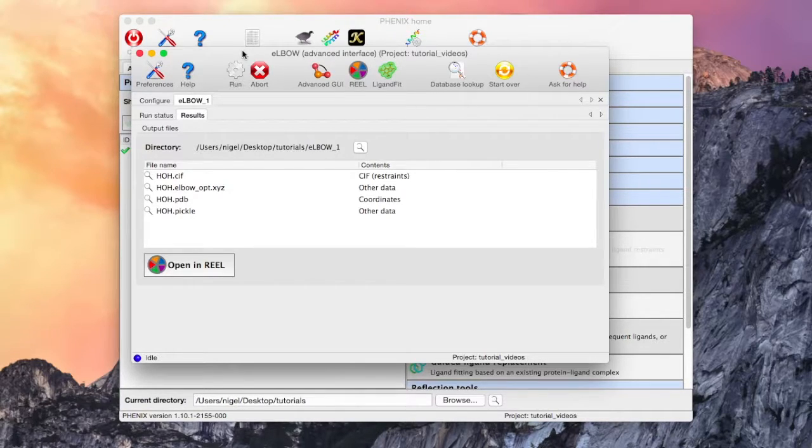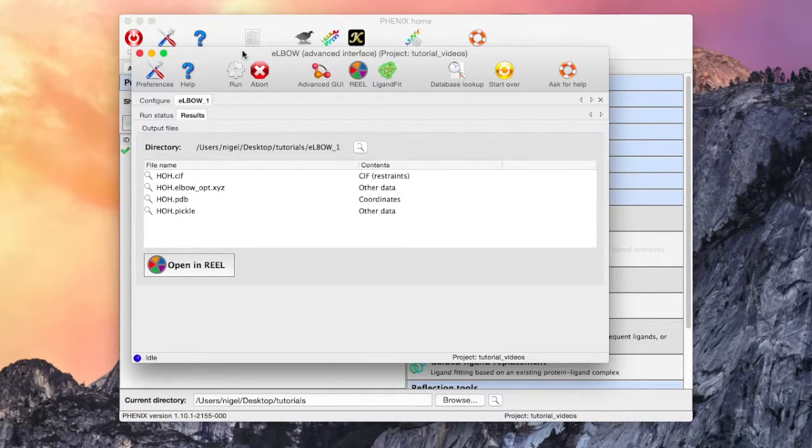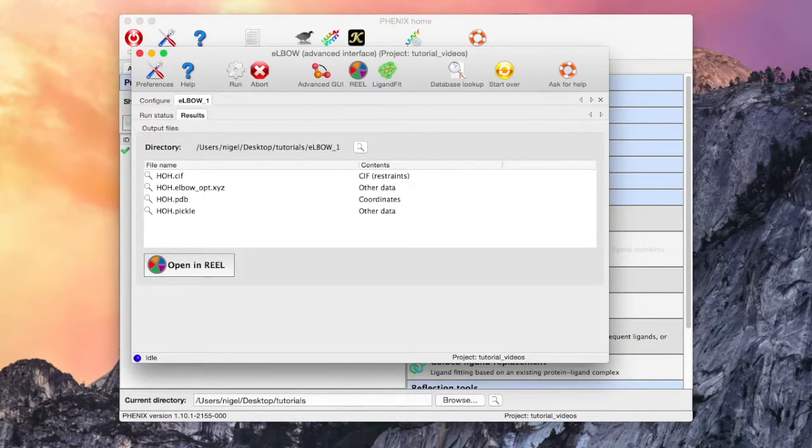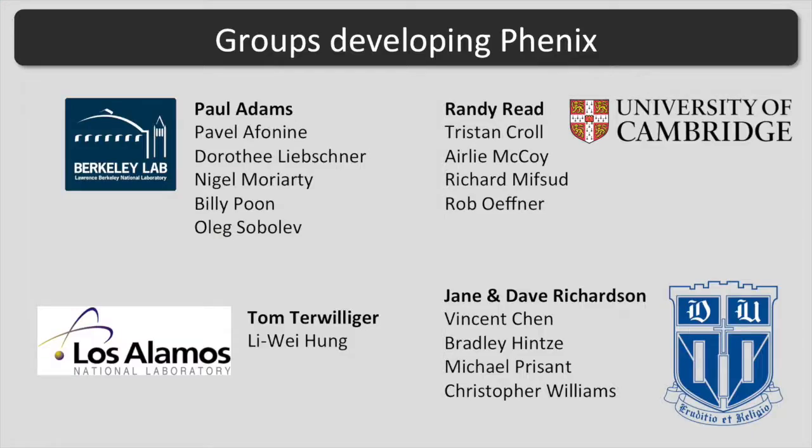This can be useful in fitting the ligand into a model. Choosing the restraints file and then the REEL button will allow you to validate and edit the restraints, but that is for another tutorial. Thank you for listening.